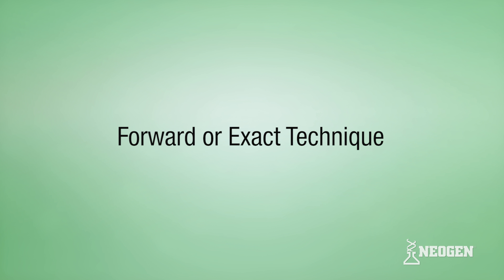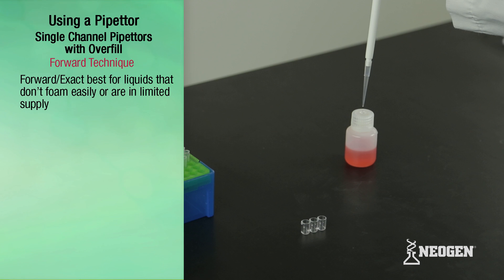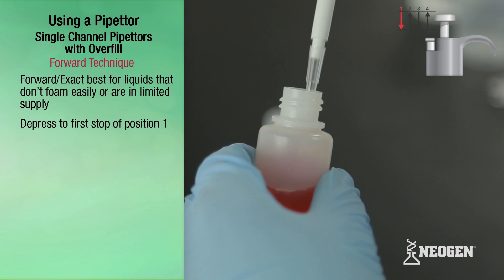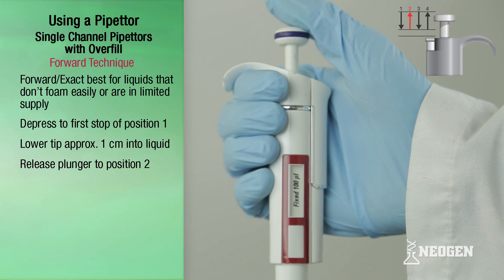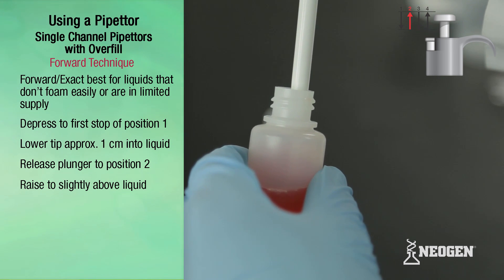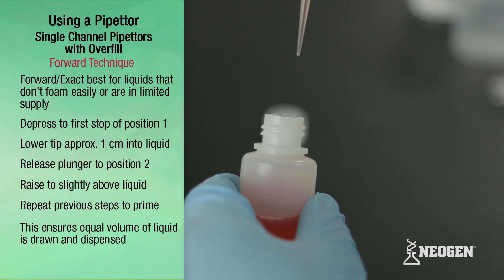Forward technique, exact method. This technique is good for pipetting liquids that don't easily foam or that are in limited supply. After attaching a tip, depress the plunger to the first stop at position one. Lower the pipetter so that the tip is placed under the surface of the liquid to about 1 cm, and slowly release the plunger to position two to fill the tip. Slightly raise the pipetter and repeat the earlier steps to prime the tip, which ensures equal volumes of liquid are drawn and dispensed.